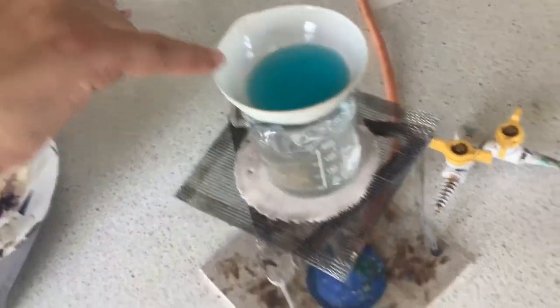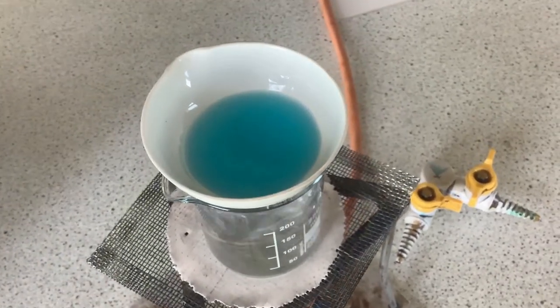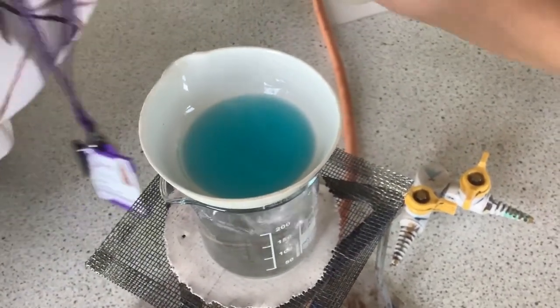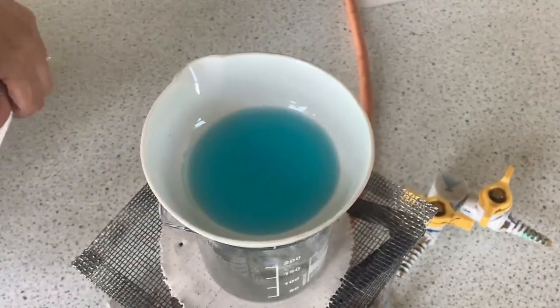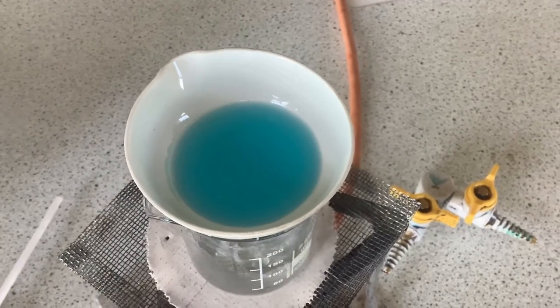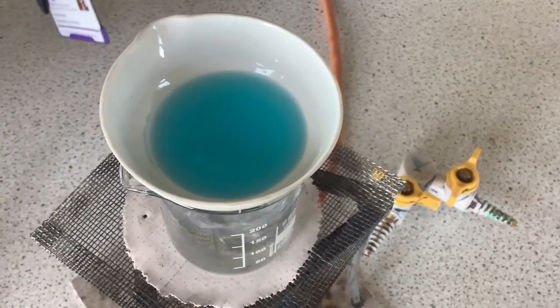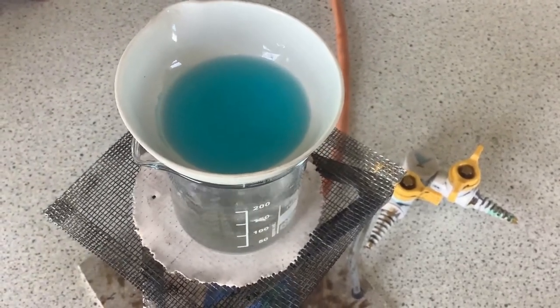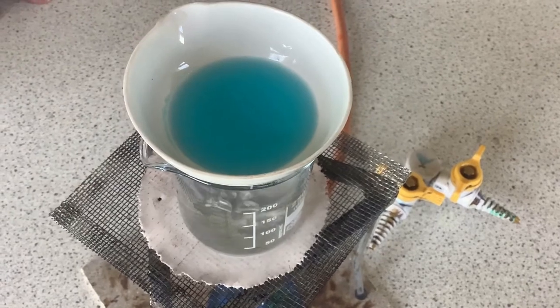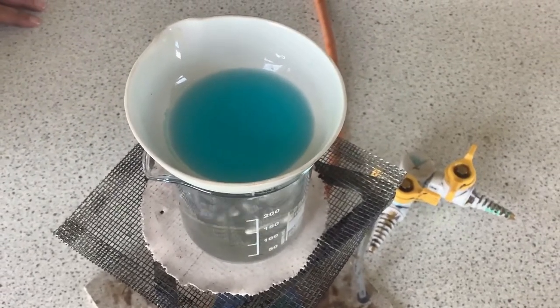At this point you can see that we've just started to evaporate a little part of the liquid. You can see a little bit round the side of the evaporating basin. That tells us that we've started to concentrate the liquid and some of the water has started to evaporate. So at that point, we remove the gas, take the evaporating basin once it's cooled down and put it on a windowsill to allow it to evaporate over the next couple of days and for crystals to form.